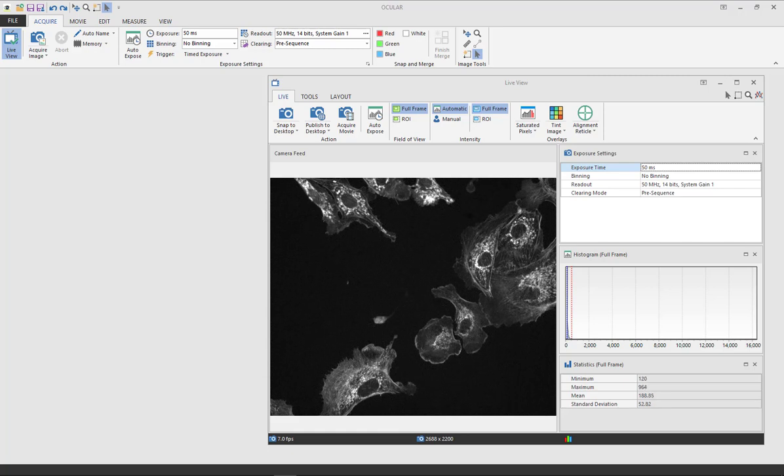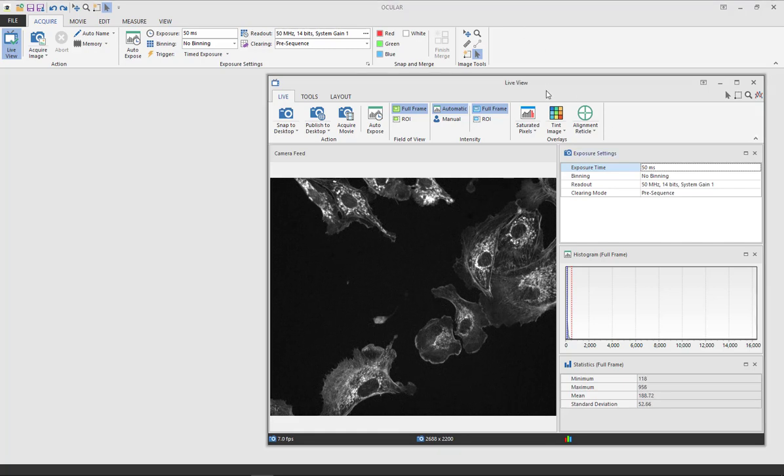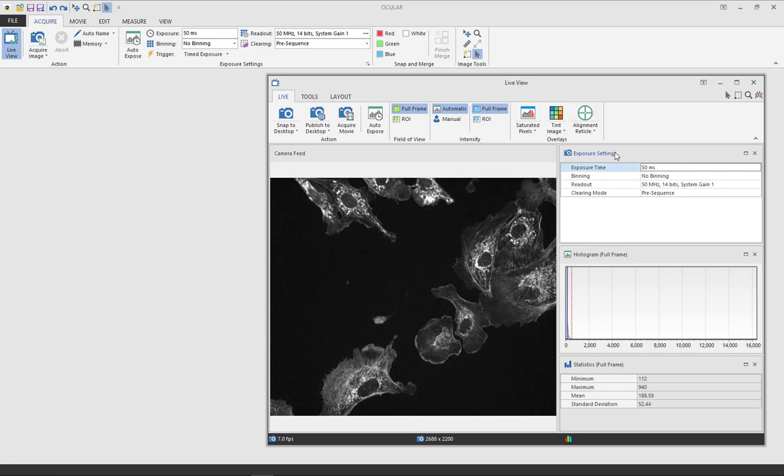When you open Ocular you will see the desktop window and the live view window. In the live view you will be able to adjust your exposure settings.